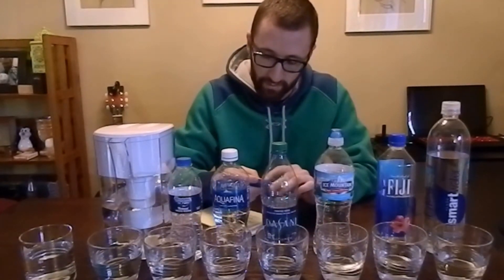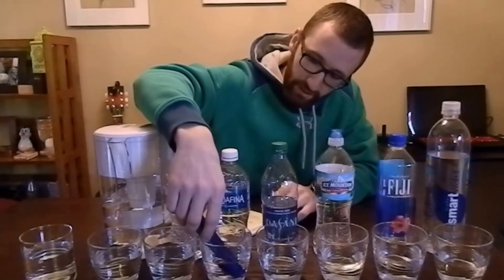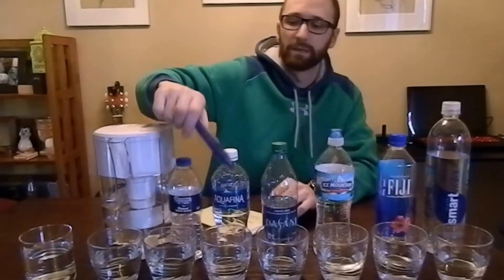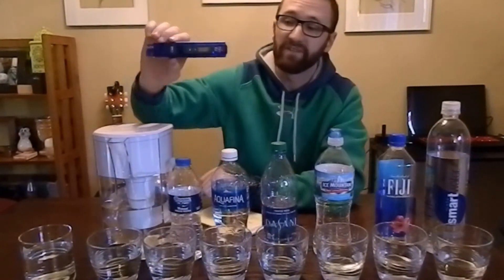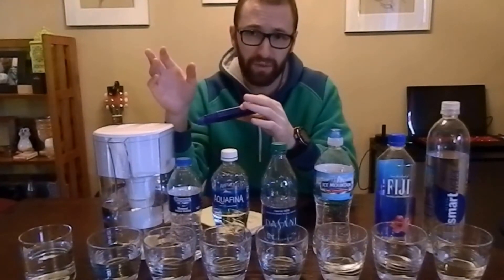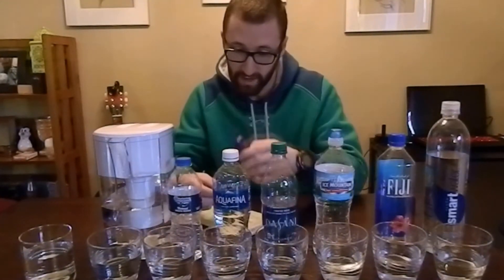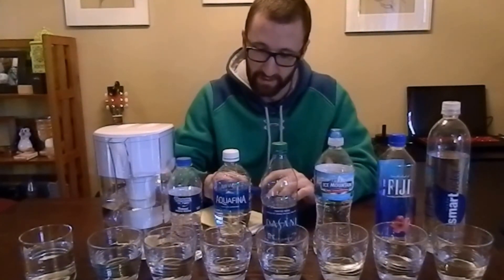Next up is Aquafina. This one isn't budging at all — went in with the same reading it's going to come out as: 5 ppm. That's pretty significant — 5 ppm is extremely low. The range goes from 0 to over 1,000, and anything from 0 to 50 is considered extremely healthy; that's the purest water you can be drinking. So to be at 5 ppm, you're next to perfect water with Aquafina. I personally didn't expect that from Aquafina.